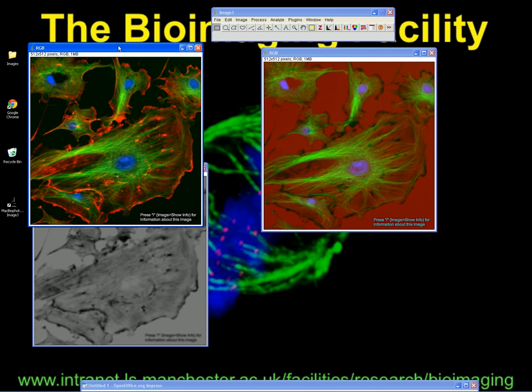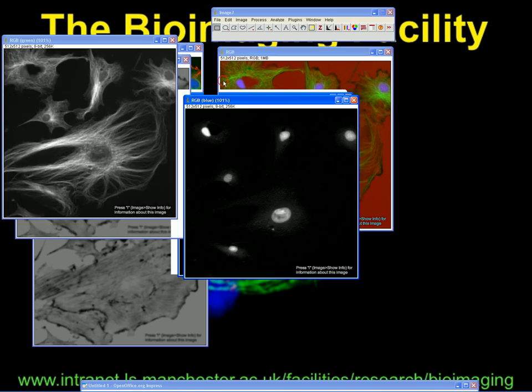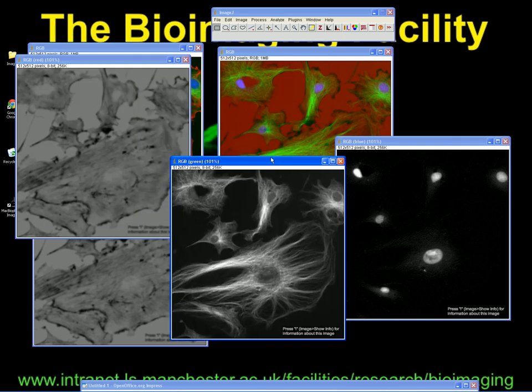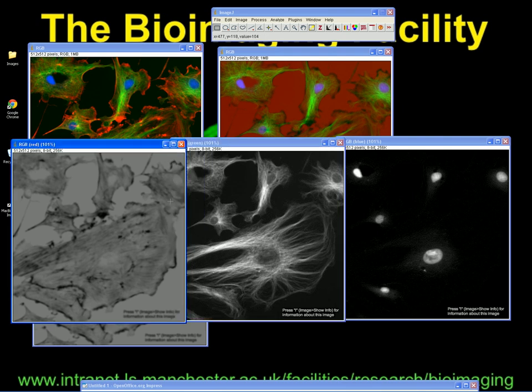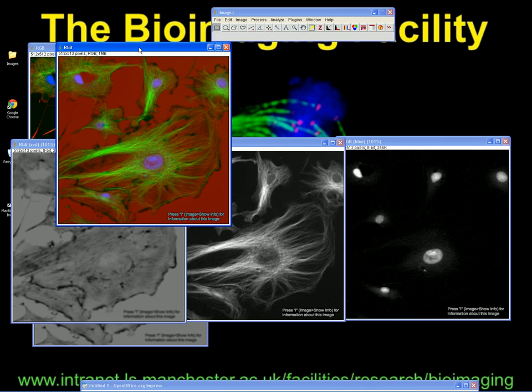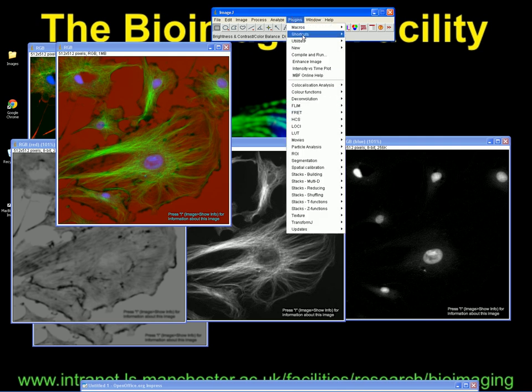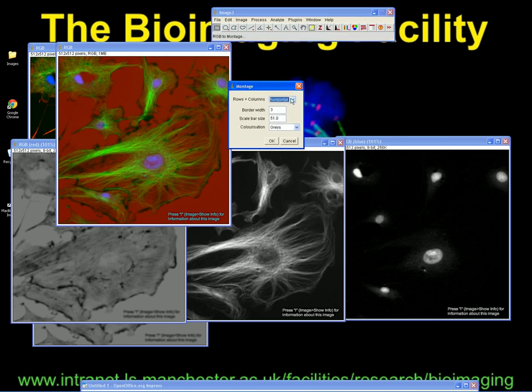Either way, if we were going to combine this one — I think this is the way that people more commonly have problems with — if we split that up into the individual channels, you have your DAPI image, your green fluorescence, and then what was pasted into the red channel is actually this phase contrast image. The problem comes if we wanted to get it to show an RGB grayscale montage in the normal way, by going through Plugins, Colour Functions, RGB to Montage, and doing it horizontally.